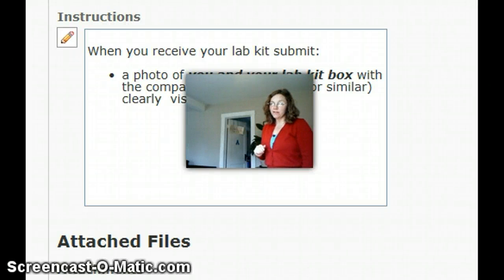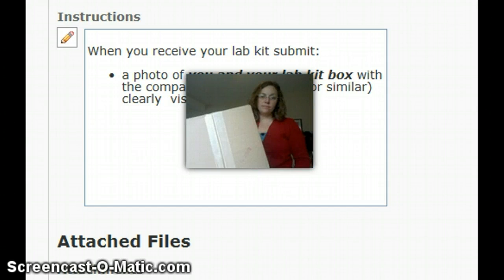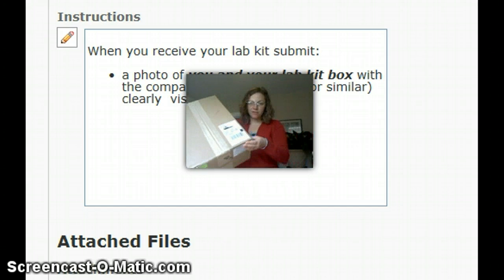Hello students, I hope you're doing well. You should be getting your lab kit really soon. I got my lab kit, so let's see it. You'll get a box that looks something like this.